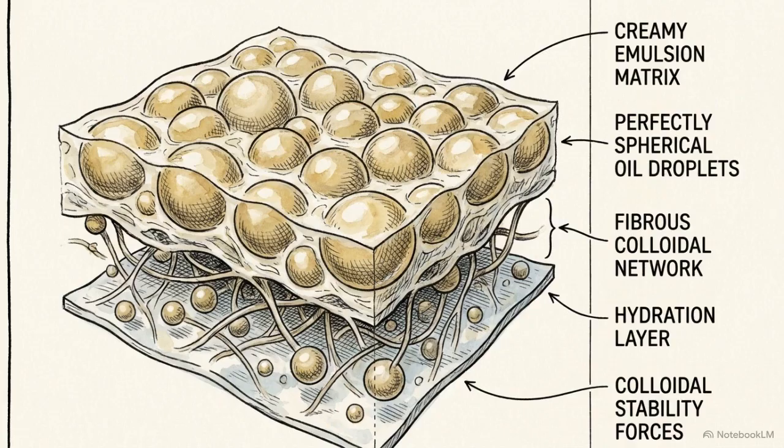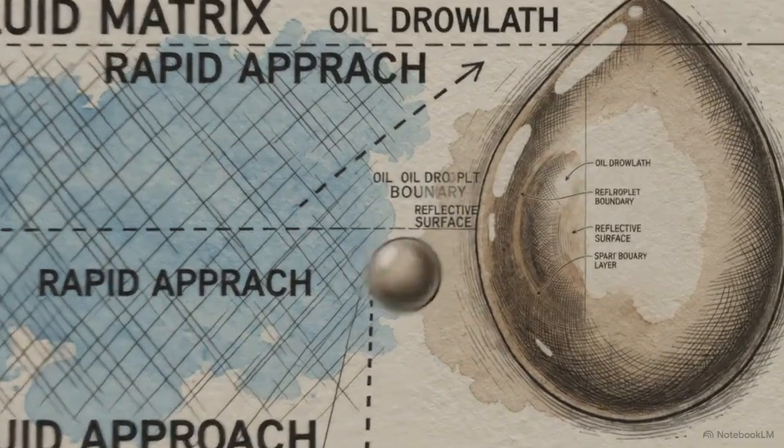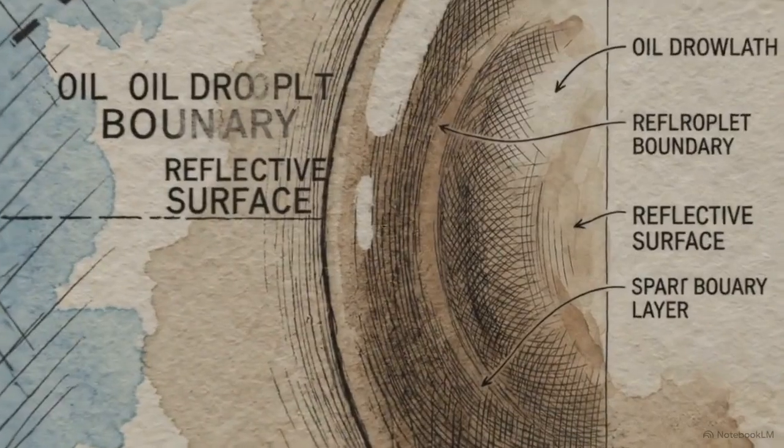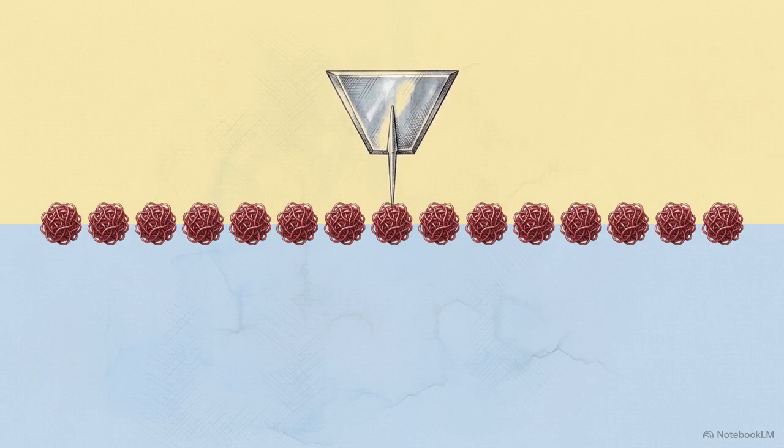This nanomechanical mapping extends beyond solid structures into fluid dynamics, specifically the stability of emulsions and foams. In a liquid matrix, overall stability is dictated by the microscopic boundary layer separating the oil and water phases. Proteins organize at this boundary, creating a physical barrier. We can probe this exact interface, pushing into a single nanometer-thick layer of molecules.